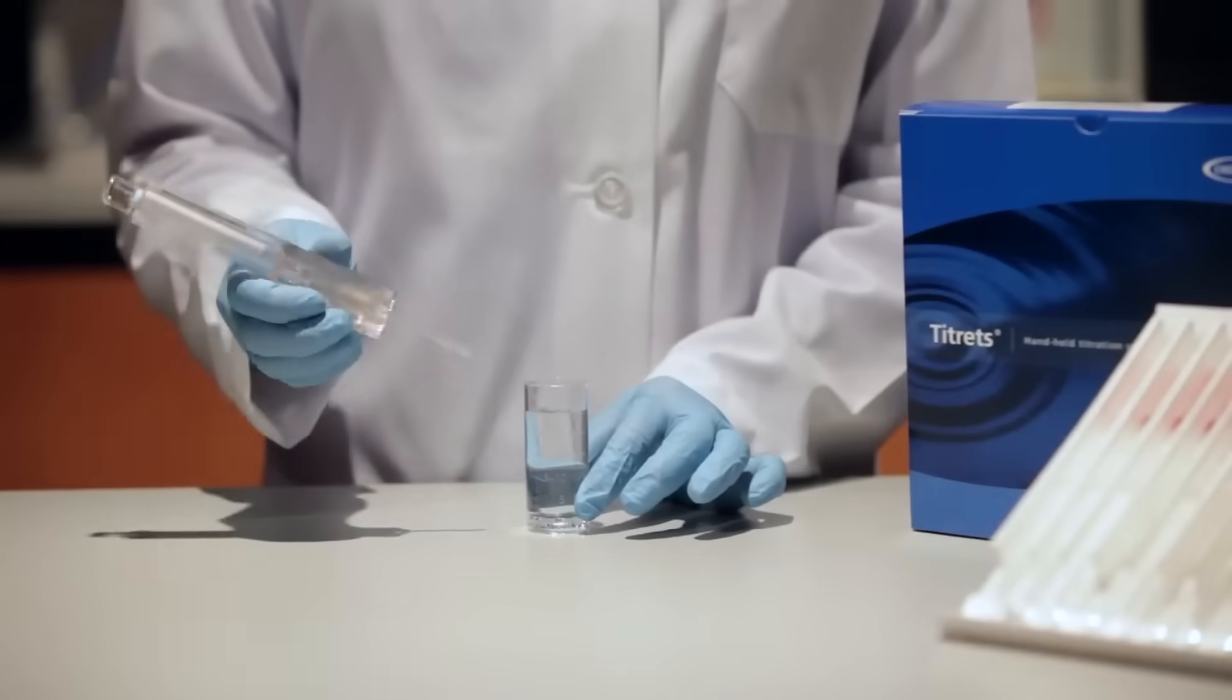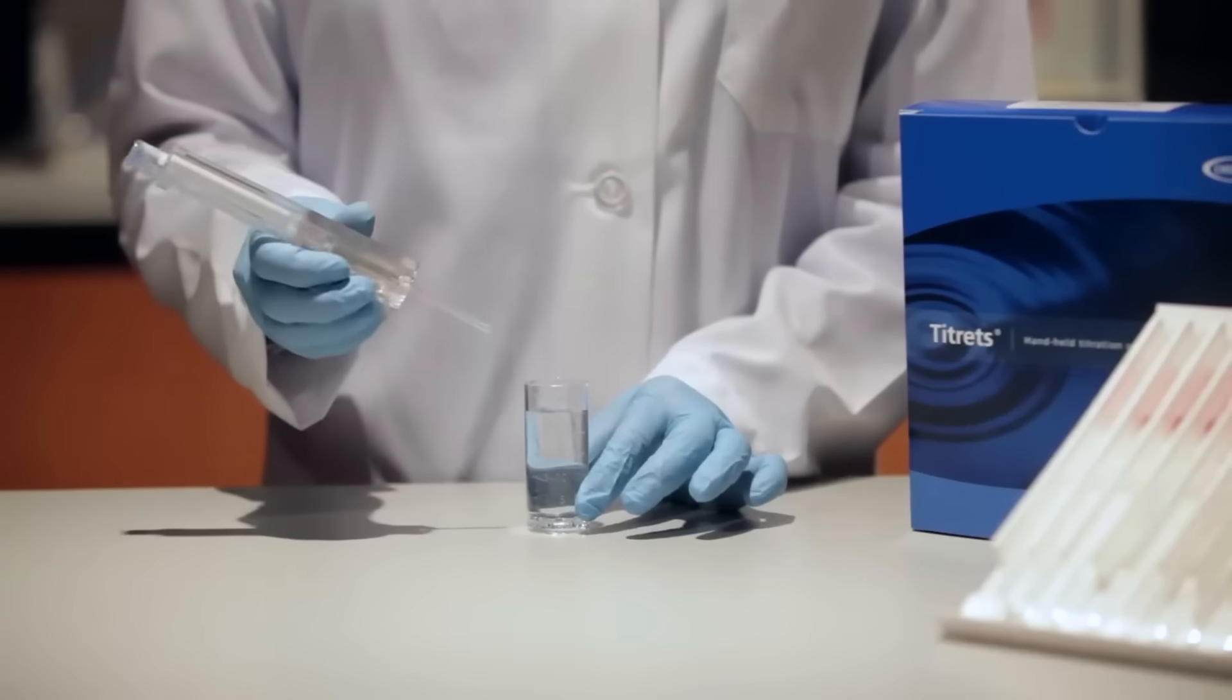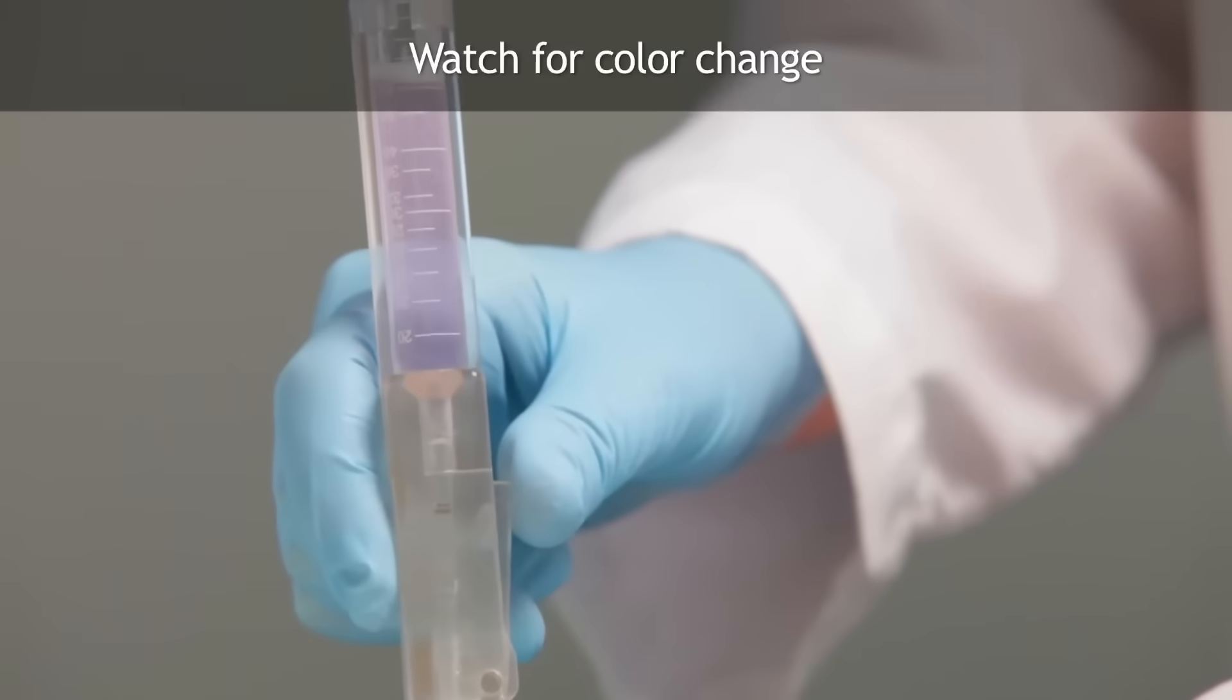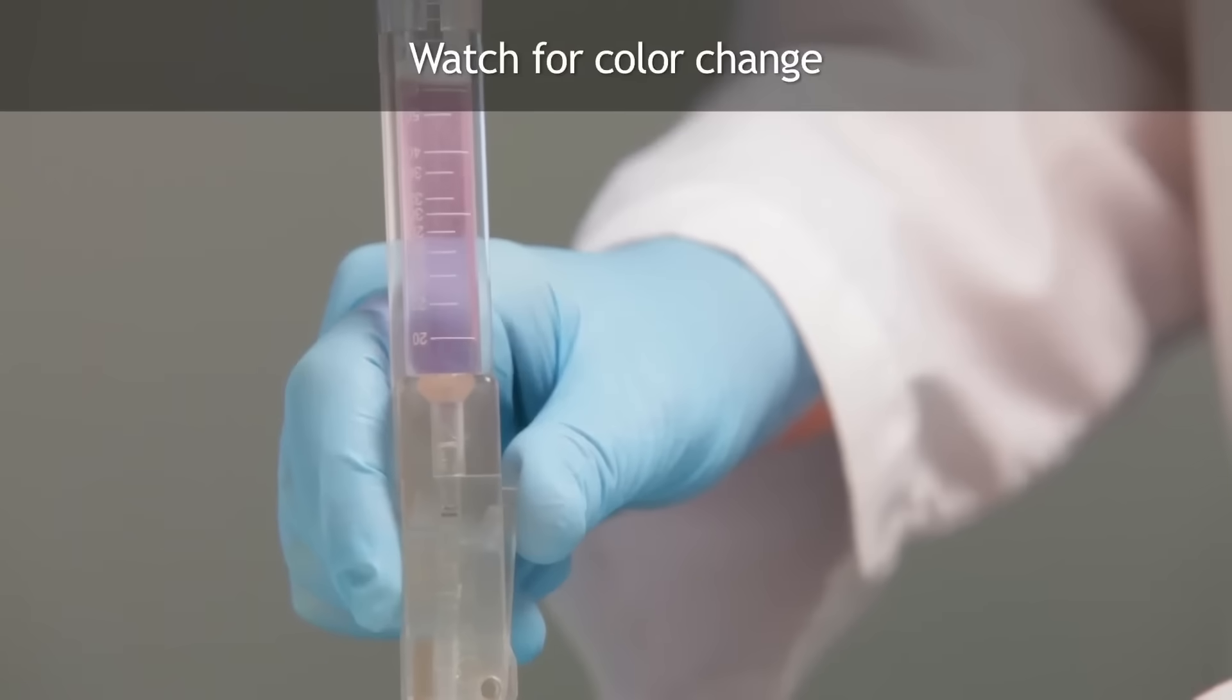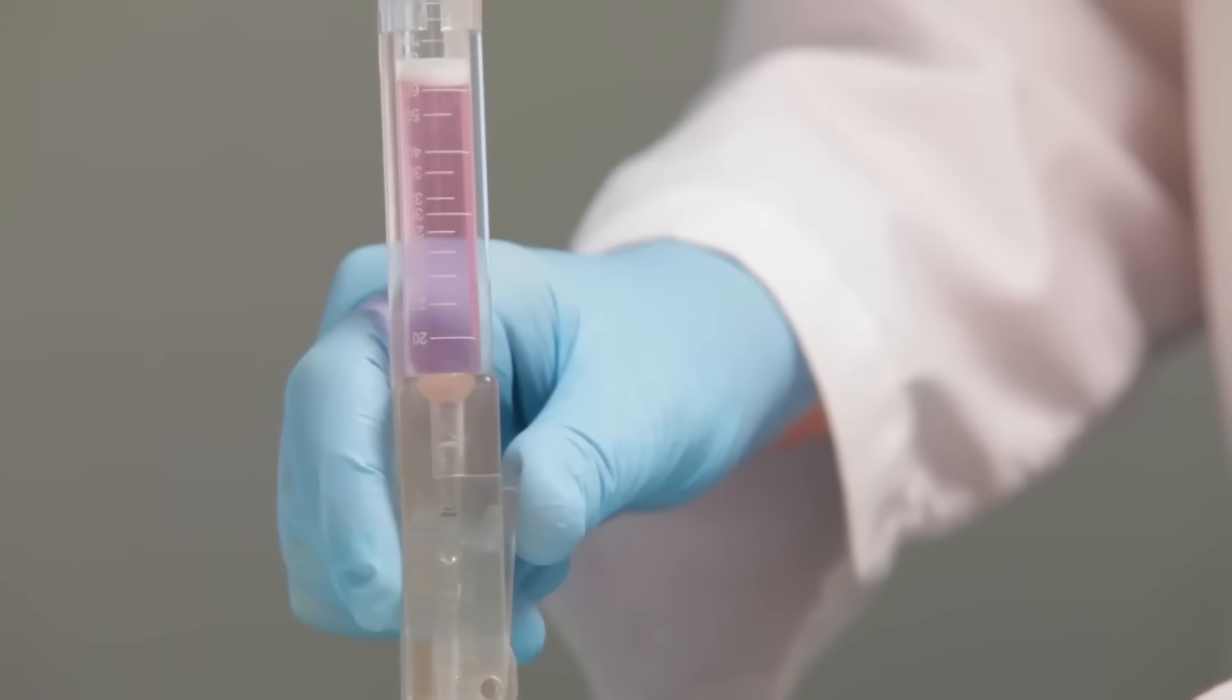After each addition, rock the entire assembly to mix the contents of the ampoule. Watch for a color change from blue to pink. When the color of the liquid in the ampoule changes to pink, remove the ampoule from the titretter.